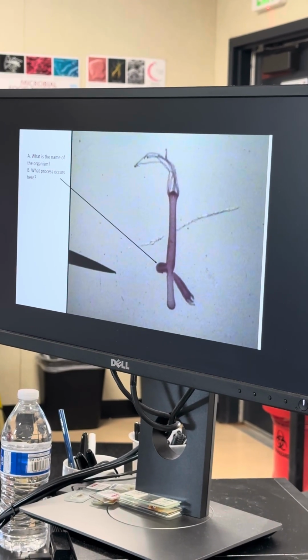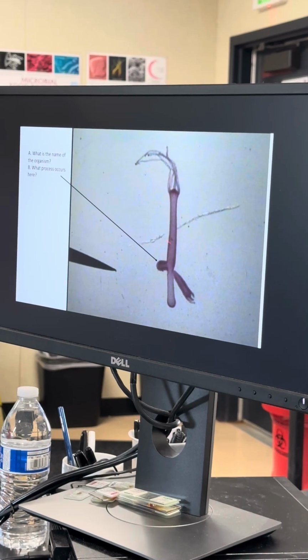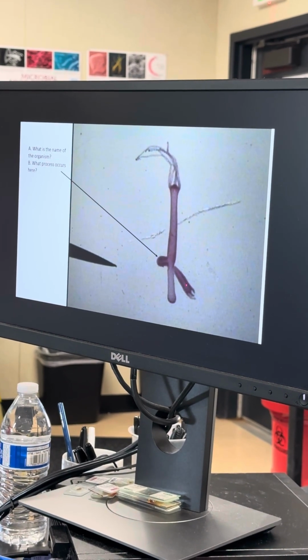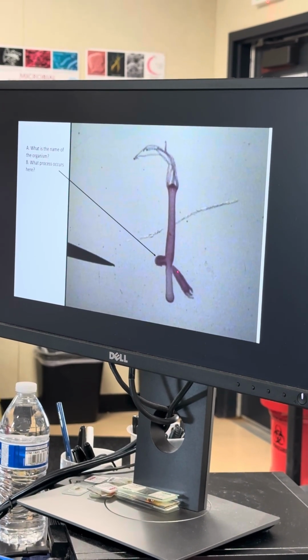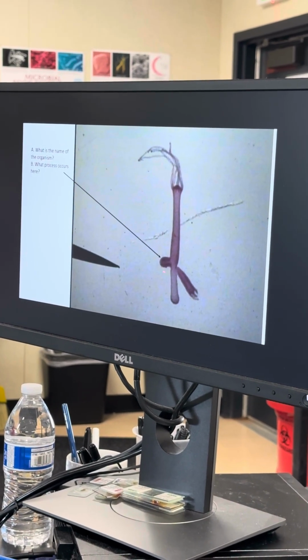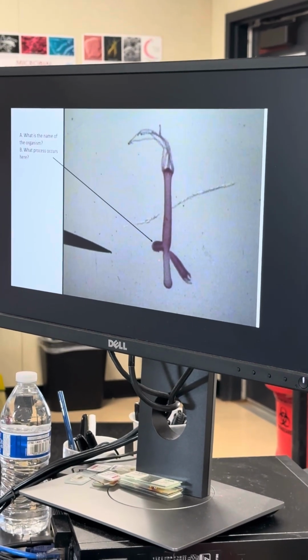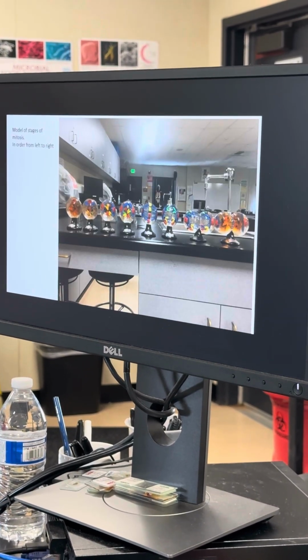We did not have hydra, we do have it in the lab. The model, I did not bring you the slide, so do not worry about the slide. But this is budding or mitosis. Budding is a type of mitosis. So this one becomes just like mother hydra. It will separate from mother hydra and sits on the bottom of the lake.